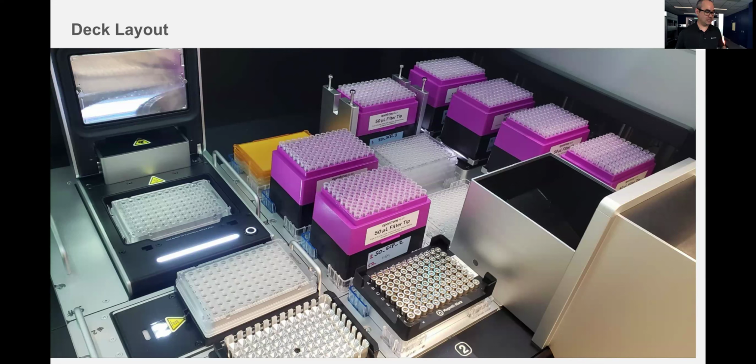In this case, you see the silver tip rack adapter in the very back. That's for when it's picking up an entire set of 96 tips. But for the 2 tip racks in the center, I have an overhang over the leftmost column where the thermocycler is, so that the 96 channel can pick up just a single column and I can do a single dispense. That is the trickle-down effect of having all these different steps on the deck at once.